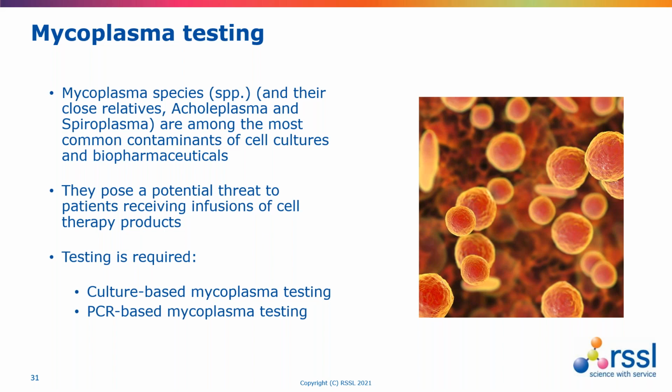PCR-based mycoplasma testing is now relatively robust and is a much faster way of making the assessment. But of course, the methods need to undergo strict validation, and it's important that each sample type is assessed against the assay as well.